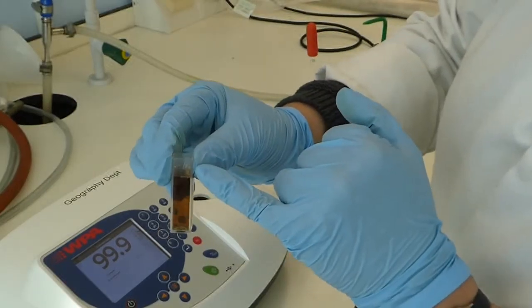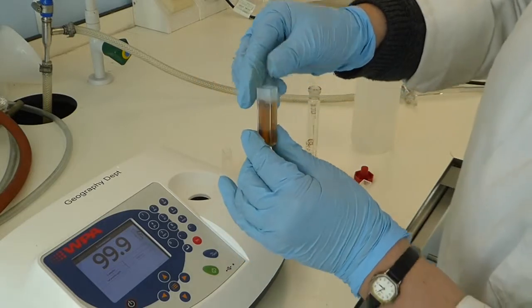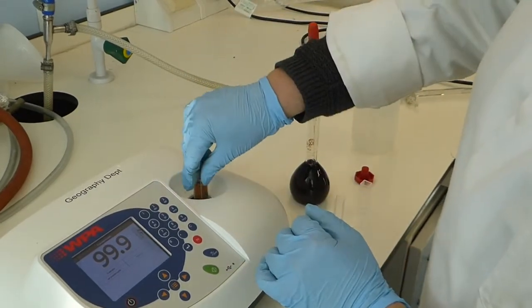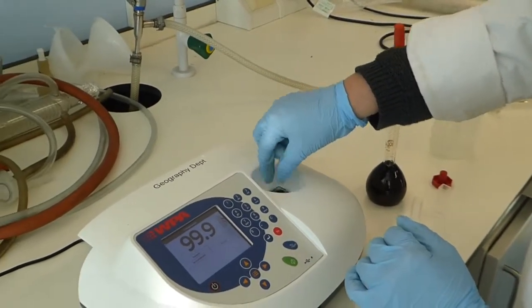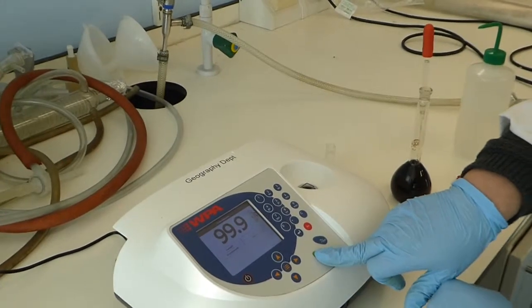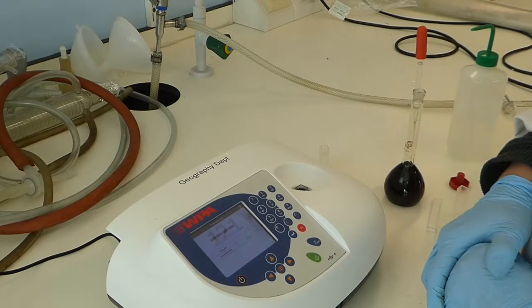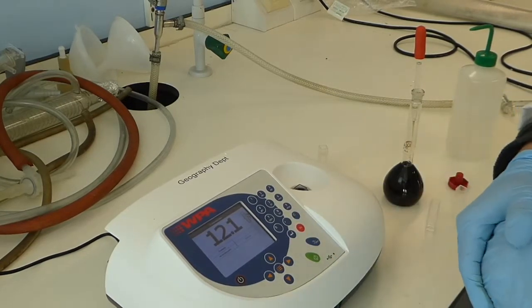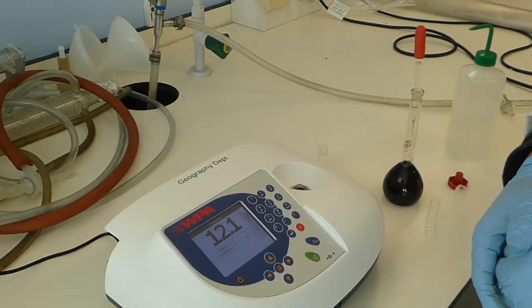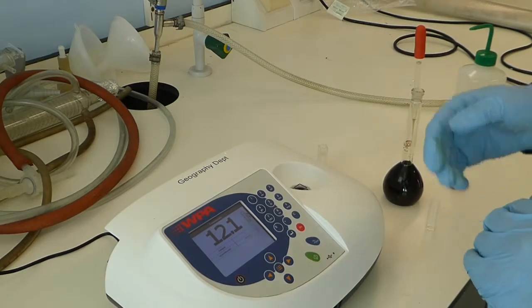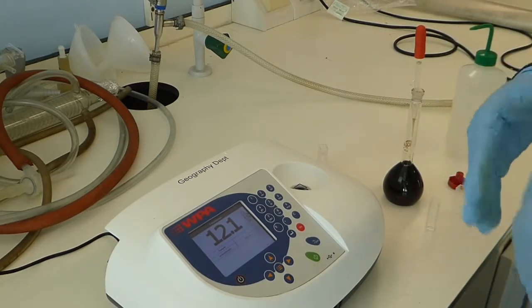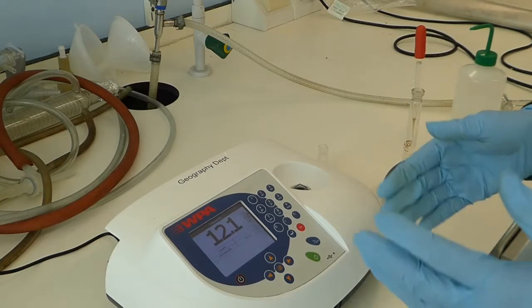And then you want to line up the arrows again. Turn that round, place it in, and then for running a sample you press the green button. That will give you a value in percent transmittance. This is reading 12.1%. You then want to do that three times for your sample using new cuvettes each time.